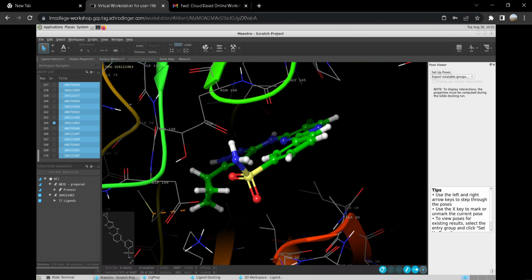But what if the ligands that you have chosen in your initial data set are not good enough to interact with your protein? In those situations, you'll have to modify the ligand molecule further to make sure you have more interactions with your protein. So what we're going to take a look at right now is how you can modify the molecule, what tools you have to maximize the number of interactions between the ligand and the protein, and also get to know the ADME properties of the molecule.